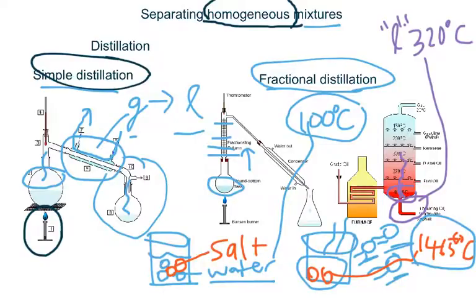And then it's like, oh, wait a second. The temperature in this part is less than the boiling point. So now all our gas will start reverting back to a liquid. So we're going to have a liquid here, and it might drain down here.